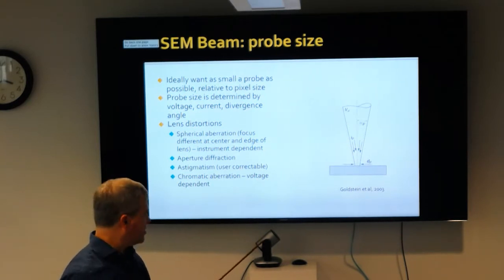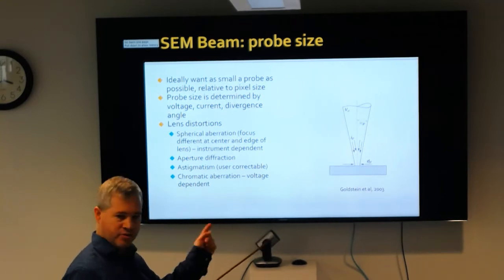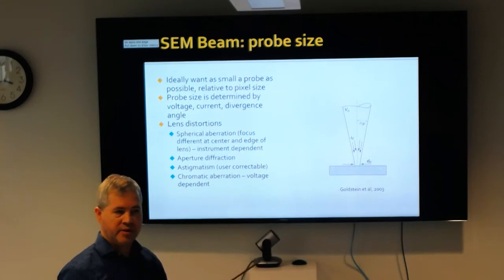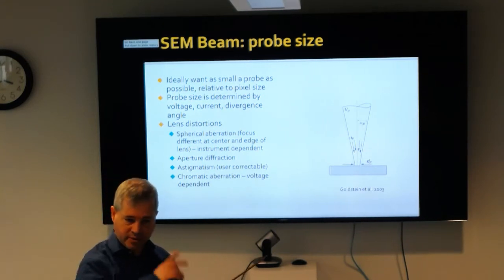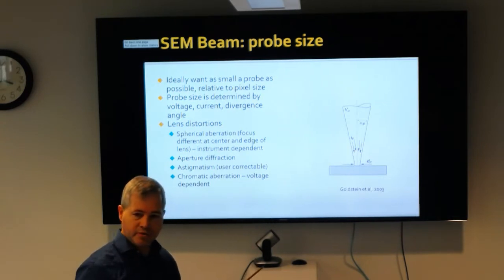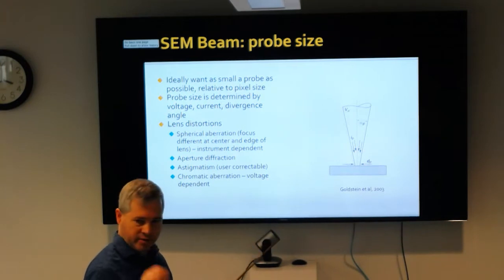In that case, you focus it down to a single point, and you scan it across the sample, and then you see what transmits through. But we don't have STEM on the scopes that we use here. It is commonly used though. So that's sort of what it's like. You're focusing it to a single point.